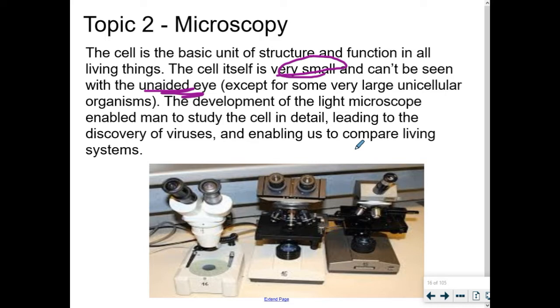of it, right? All of your cell phones, you guys know how if you just take the two fingers and you do this, right, where you separate your fingers, you can zoom in, right? That's magnification. But the other word we want to use is something called resolution. Resolution is your ability to distinguish two consecutive points. I'm going to say that again because this is a really important concept. Resolution is your ability to distinguish between two consecutive points.